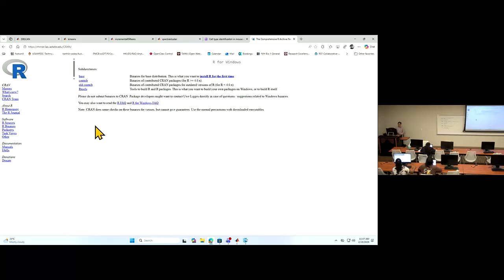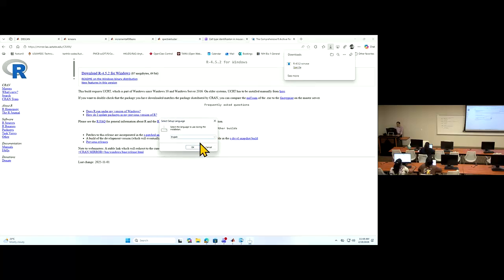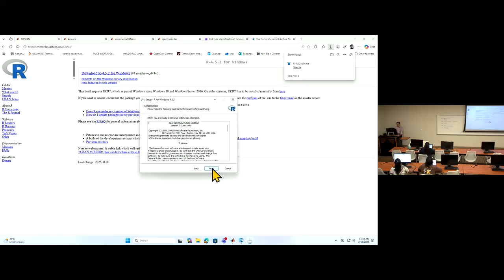I'm just trying to install my very basic setup of R for myself. I need to remember where I installed it.